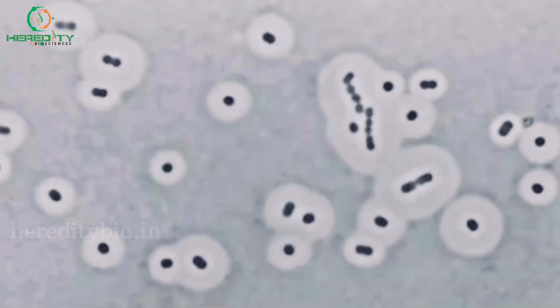Before jumping into the experiment, first we will look at what a capsule is. Capsule is the outer covering of bacteria which protects bacteria from extreme surroundings. When we see the capsule under microscope, it will look like this. The bacteria shows black color in the middle and the covering is the capsule.